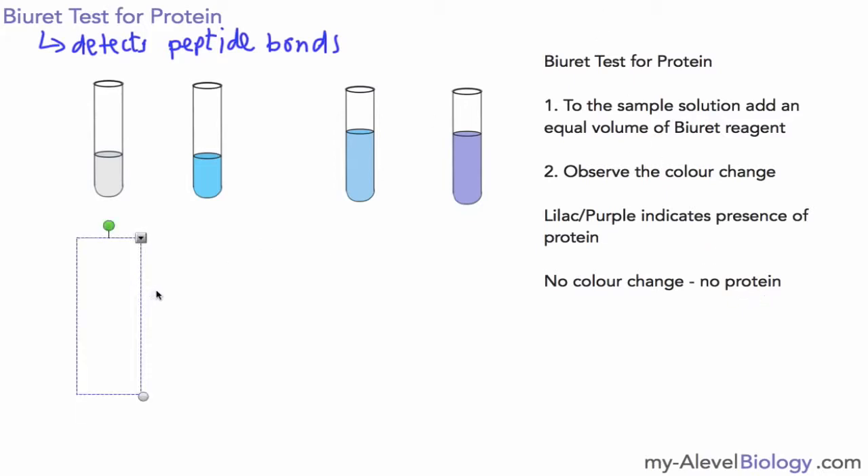The only complication you might have is if you've ground up a food substance or dissolved something and the colour of the solution makes it hard to see any change. If I add biuret reagent to this kind of sample, it's not very clear to see the blue colour you'd expect, and if there was protein present and it changed to a lilac colour, it might be quite hard to see because of the colour of the actual food sample.